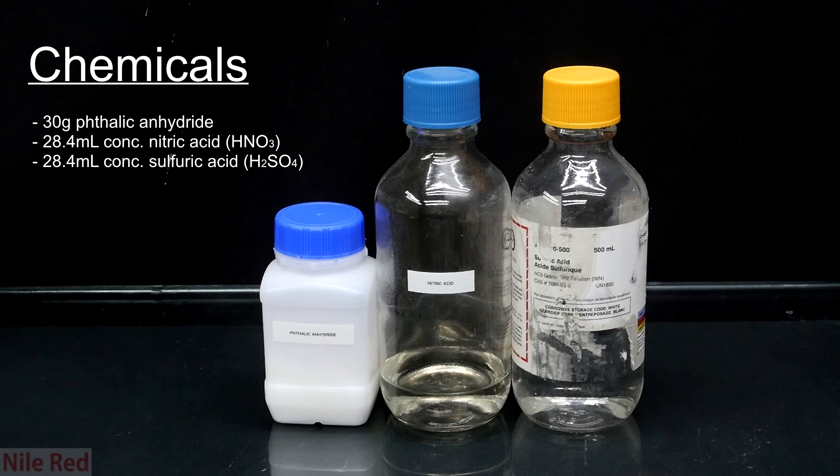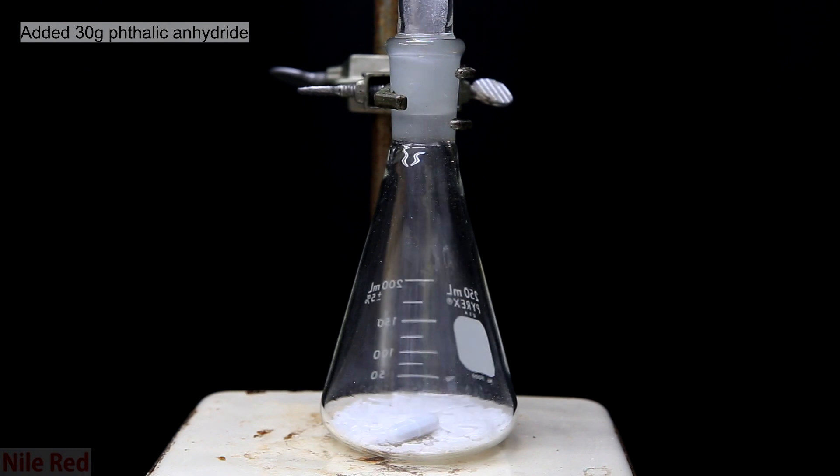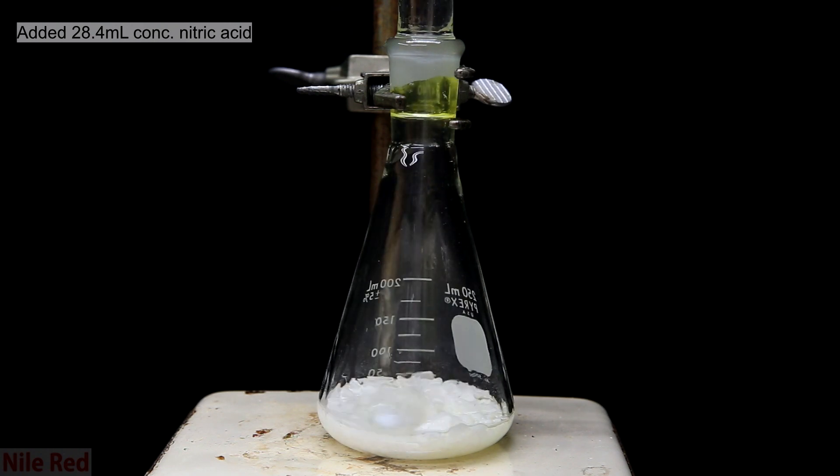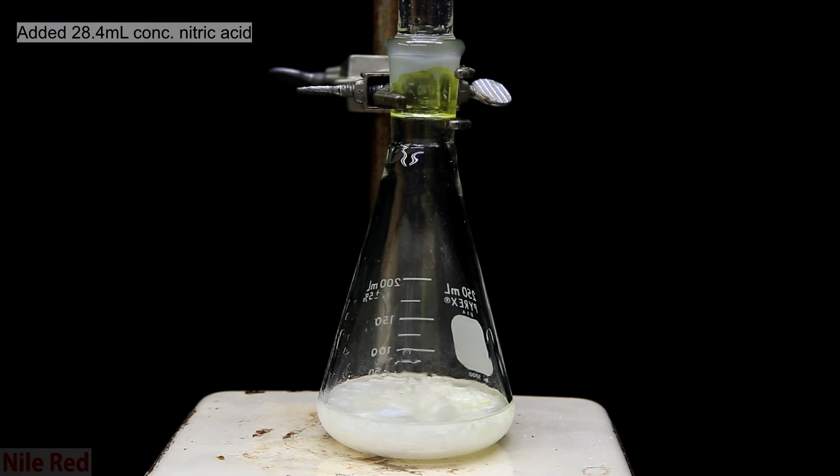Anyway, now we know what we need to do it, so let's get started. To an Erlenmeyer flask, I add in 30 grams of phthalic anhydride. I start stirring using a magnetic stir bar and I add in 28.4 milliliters of concentrated nitric acid.